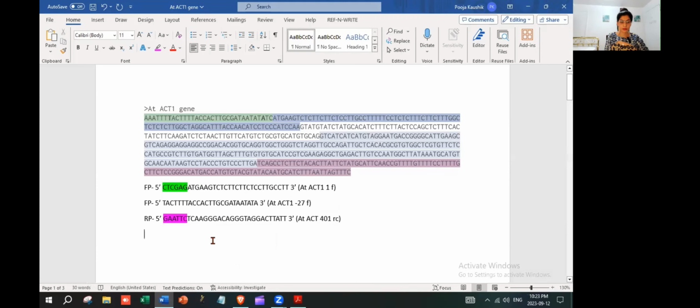I think, yeah. So now we have both the primers with the desired enzyme sites flanking a sequence. Here, once we have added the enzyme sites, our name of the primer also changes. Until now, we have named it Arabidopsis thaliana ACT1 forward. This primer doesn't give you any information about the enzymes that you are going to add in your sequence.